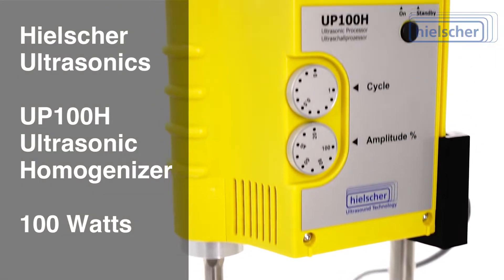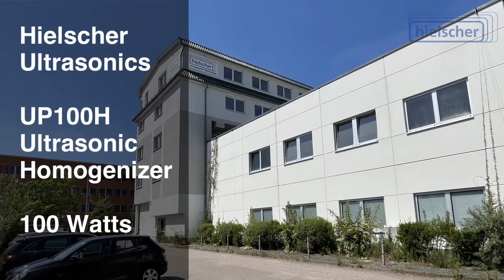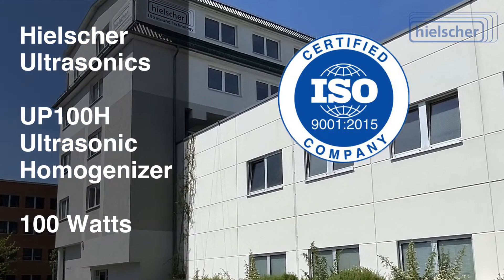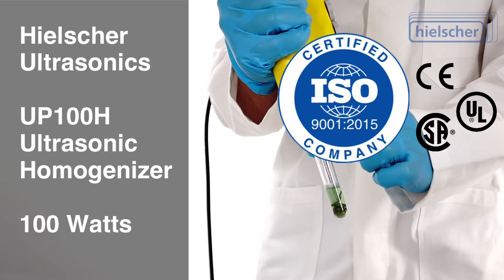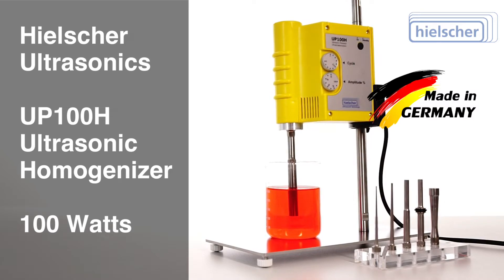The Healshure UP100H is available for all common power outlets worldwide. Family-owned Healshure Ultrasonics in Telltale, Germany is ISO certified. Of course, the UP100H complies with CE standards and is UL, CSA, and RoHS compliant. The UP100H is quality-made in Germany.